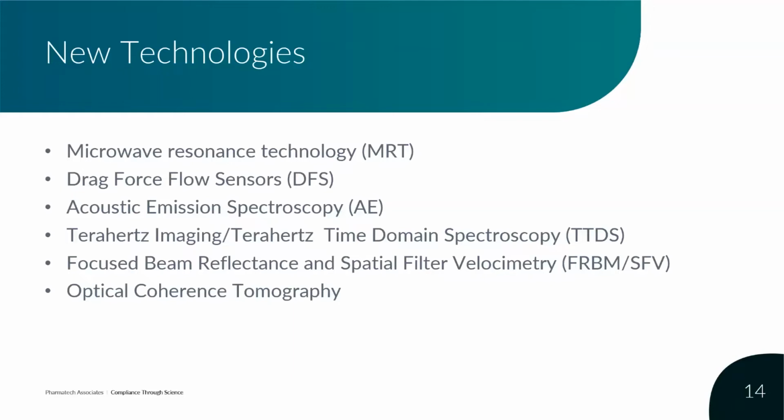And a laser in, for instance, a focus beam reflectance probe scans back and forth across the sensor and backscatters some of the light.